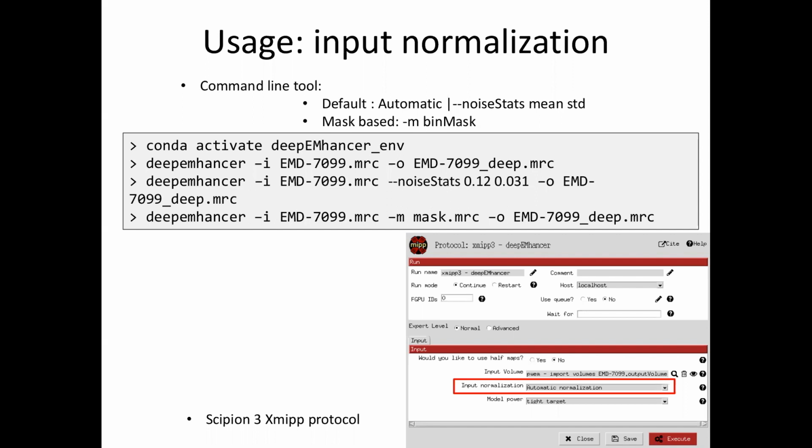Okay. Let's say there have been projects I've worked on in the past where the density that's poorly localized is unfortunately the density that's biologically significant. Yeah, for those cases, the best way is to try to use it automatically, or at least in the default mode, because if it is able to see the noise, it will be able to learn to make use of that. Whereas if you are using this mask version, it is only able to see what the protein levels are, and this is not as powerful.